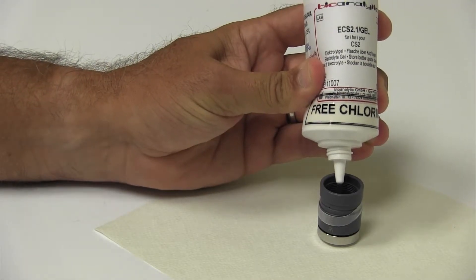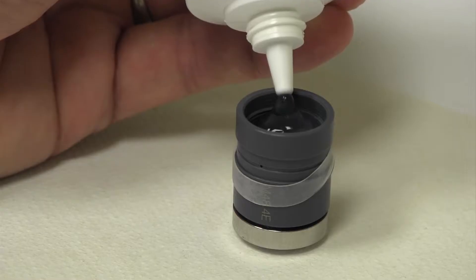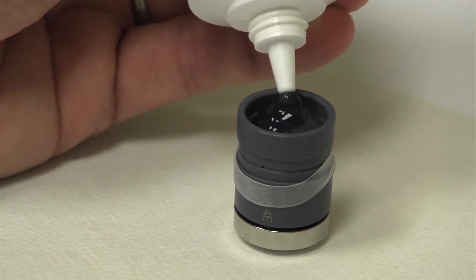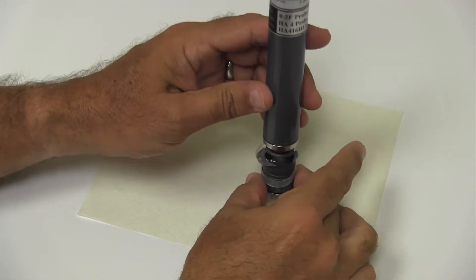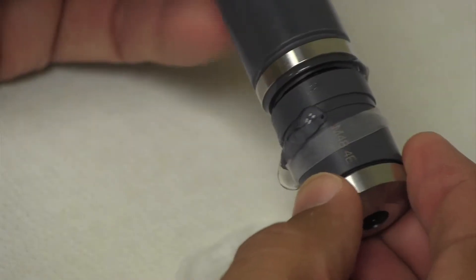Slowly fill the membrane cap to the edge with electrolyte gel, not allowing any air bubbles to form. Hold the probe body upright while inserting it slowly into the membrane cap, and screw the cap onto the probe.